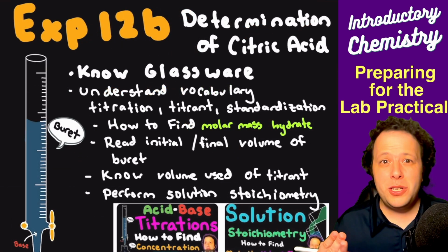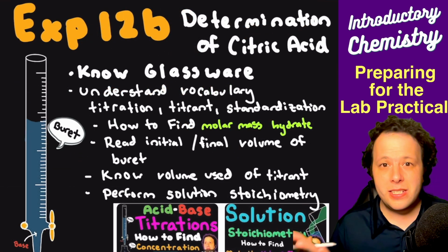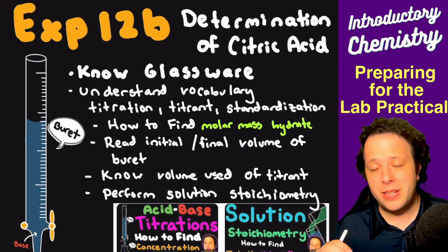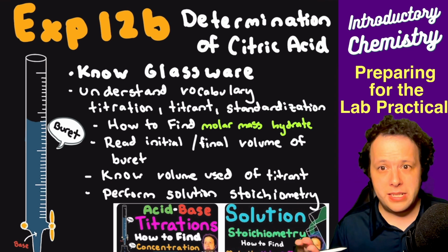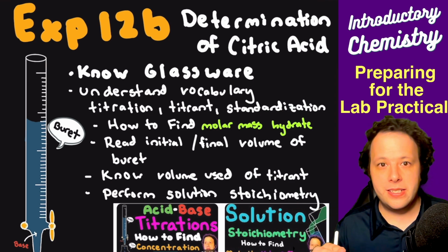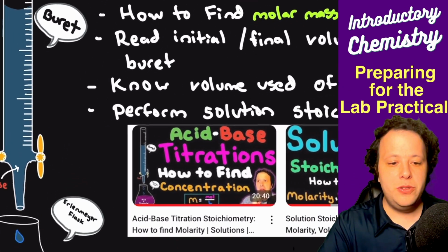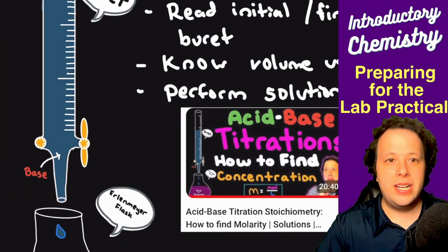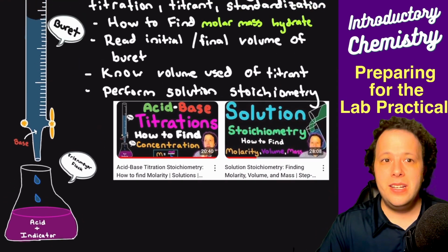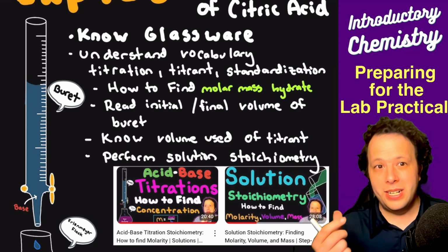All right, so experiment 12B, which was the one that we've done the most recently. This probably should be the freshest one in your brain, so you should be familiar with how to do it for the practical the best. There was a lot being done in this lab. The first thing is knowing your glassware, right? We had some new pieces of glassware. We had a burette, and then we also had an Erlenmeyer flask. That was the first time you were using those. So make sure you're able to identify them and to know how to read them, right? Especially the burette.